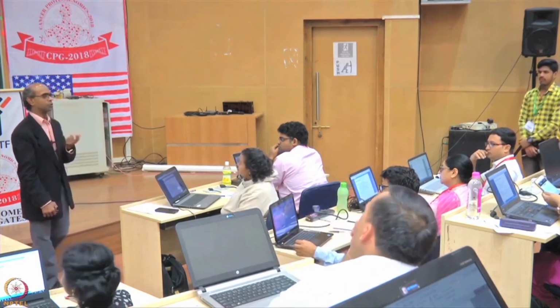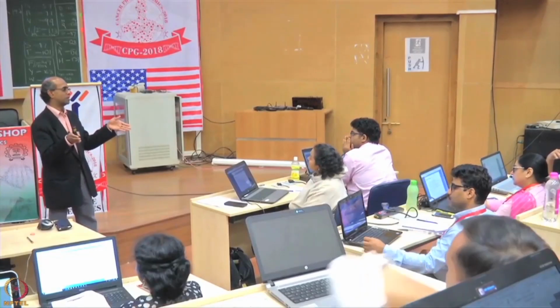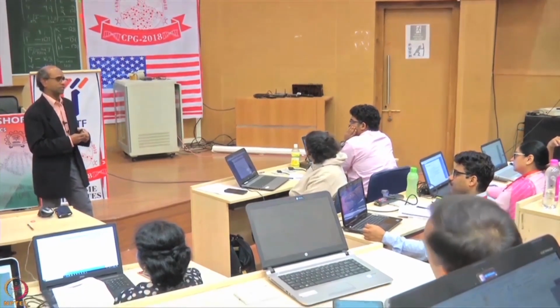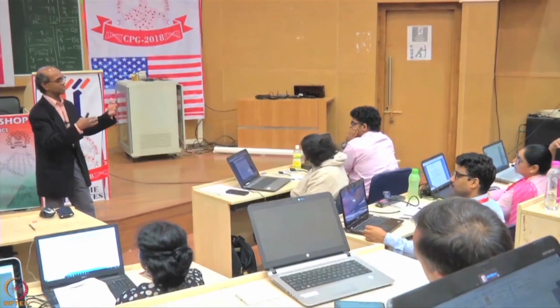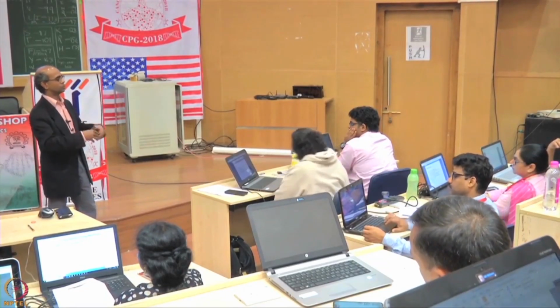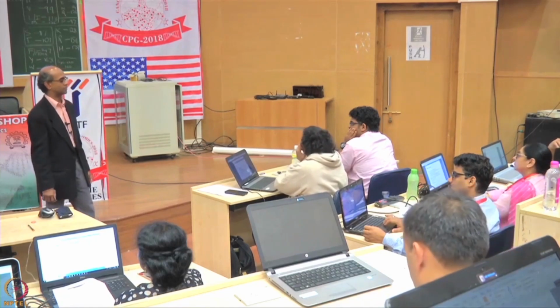So I think the rule of thumb is, if your experiment will fit in one TMT reaction or one TMT experiment, you don't need a reference. But if it is going to span more than one, you should think about having a reference. In some cases, if there are like 2 or 3 10-plexes, depending on the conditions and the experiment, maybe you don't need it. But if it is a big discovery study where you have 100 samples and you need to do like biomarker discovery or proteomic analysis of all those samples, then you would have a reference.